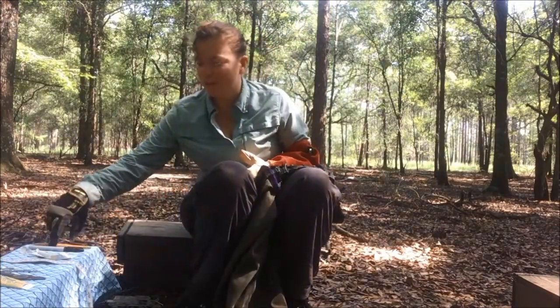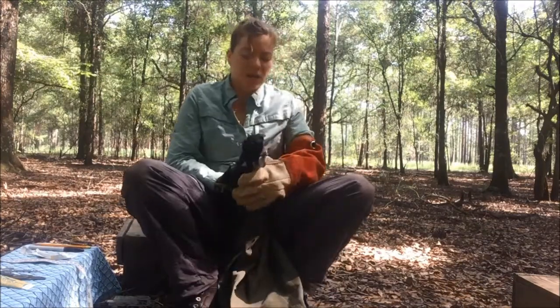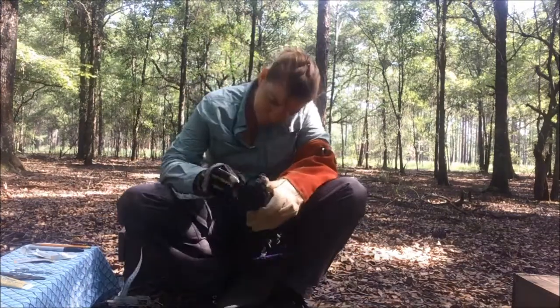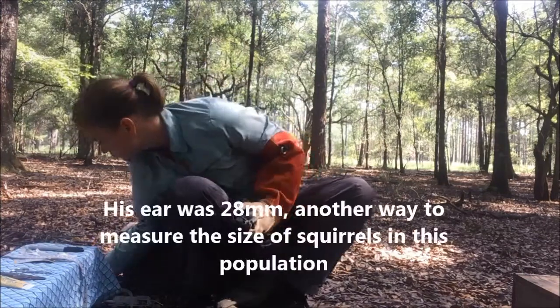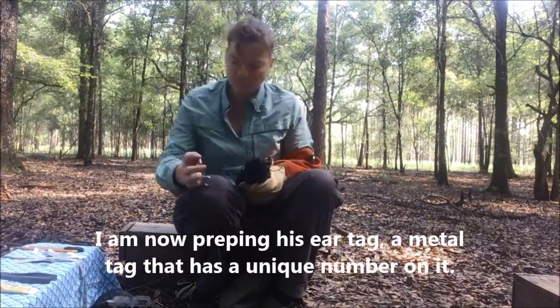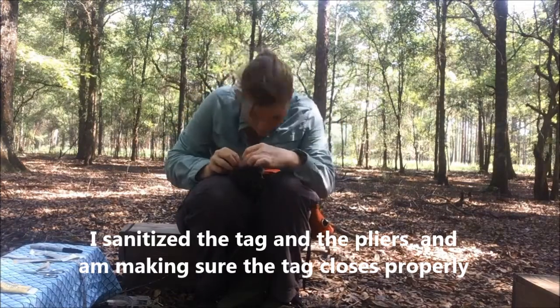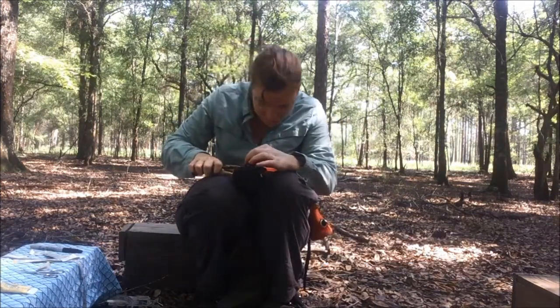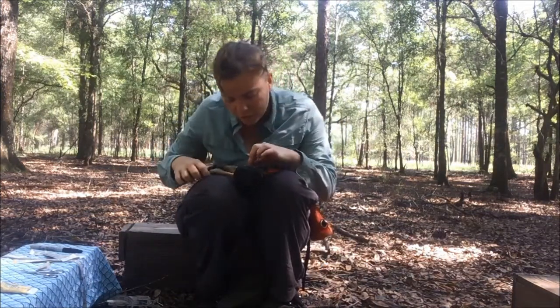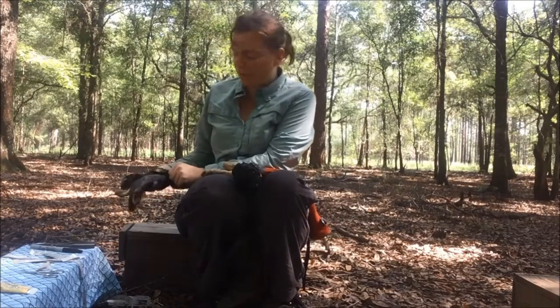The next and final thing we are going to do is measure and mark his ear. It's successfully in there, and you can hear that he has something to say about that process.